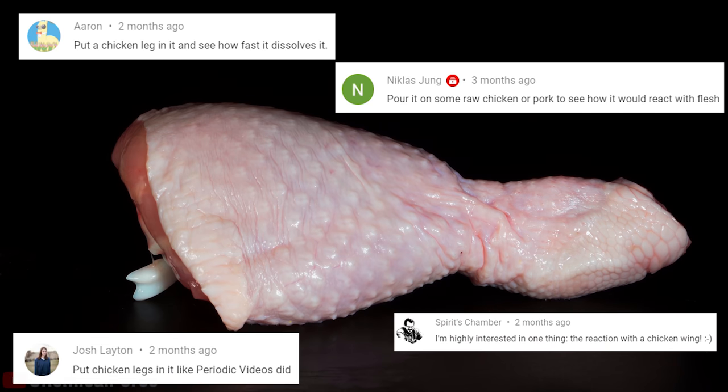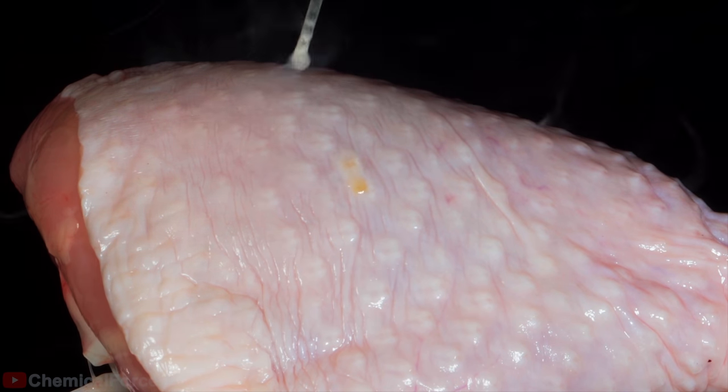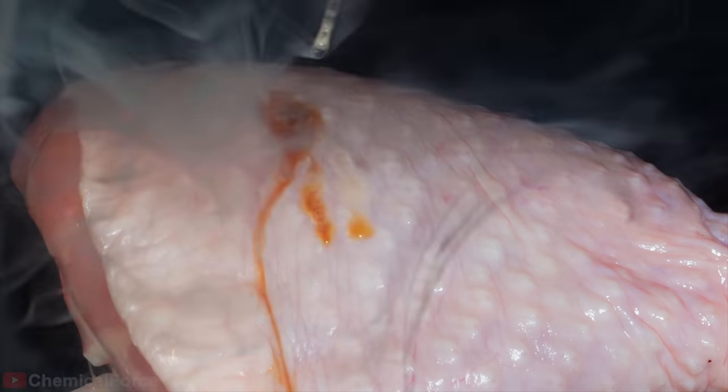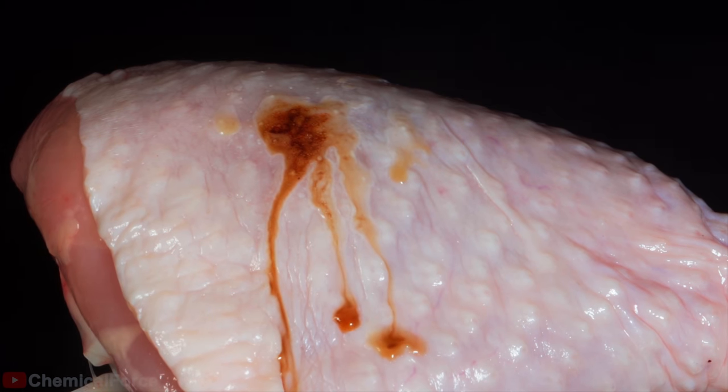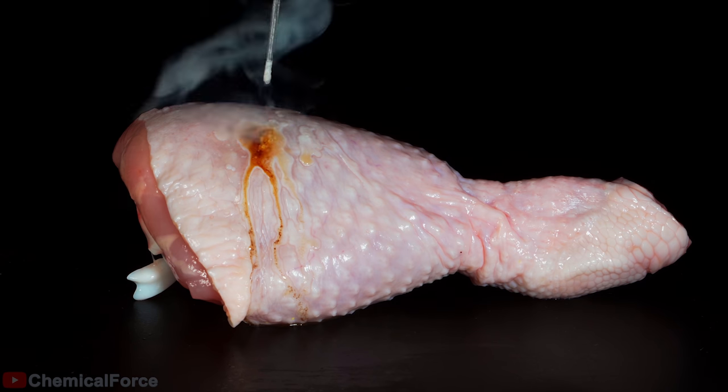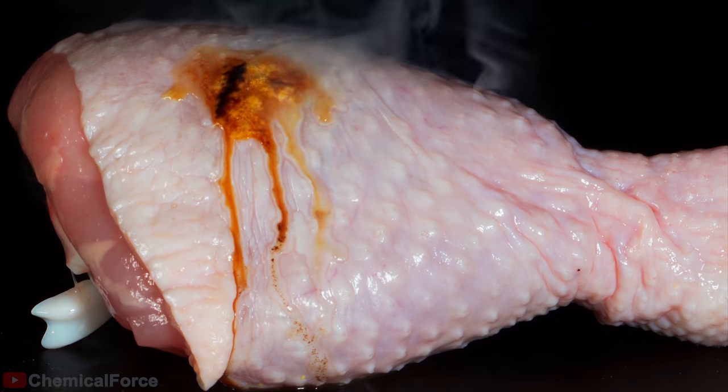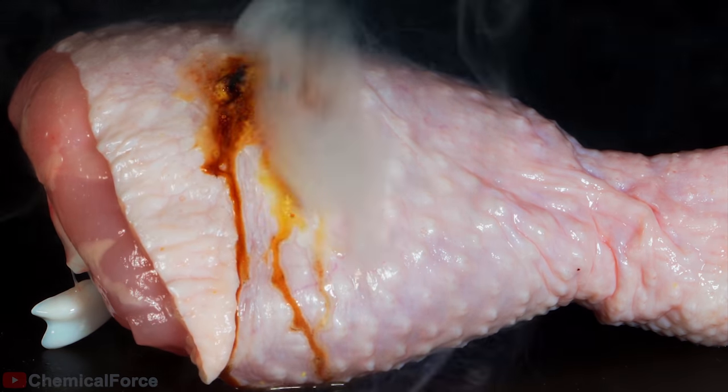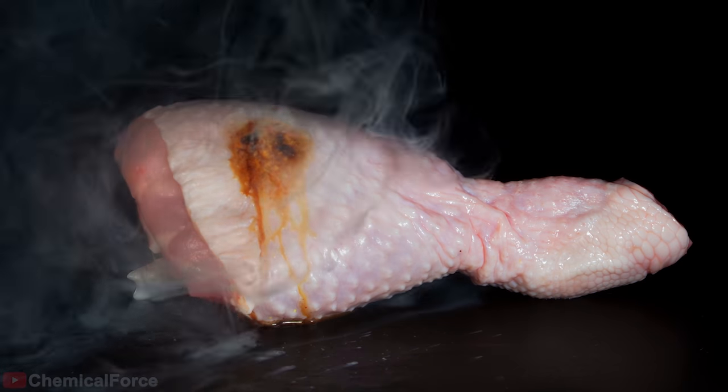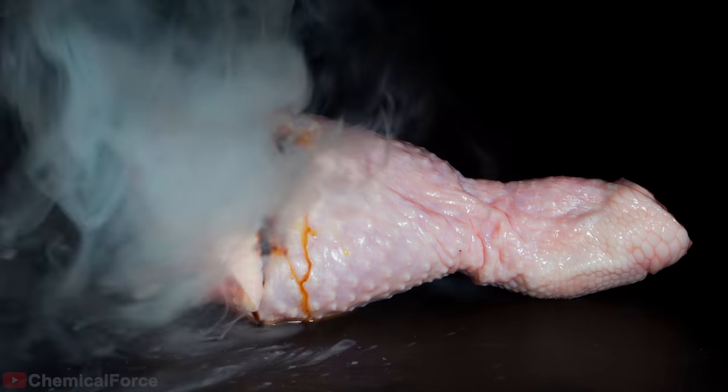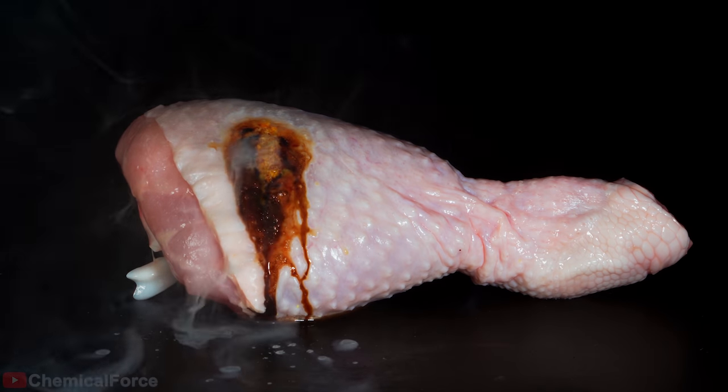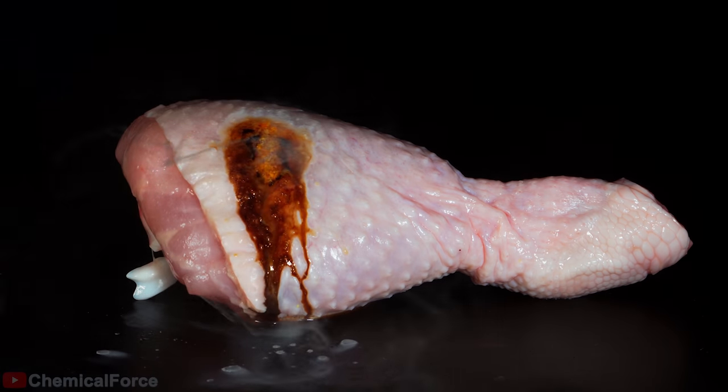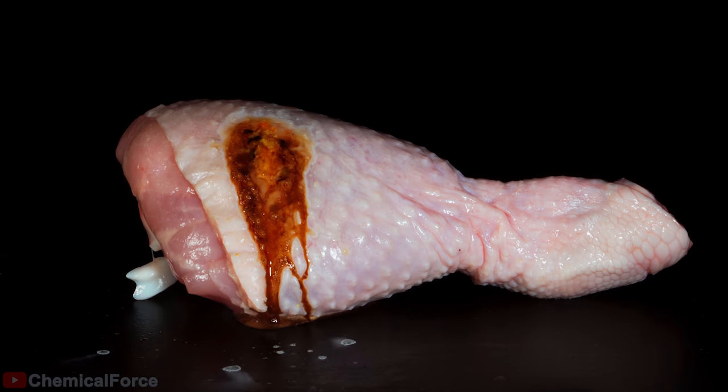Now, let's see how the strongest acid in the world reacts with flesh. I'll use a chicken leg, like you asked.